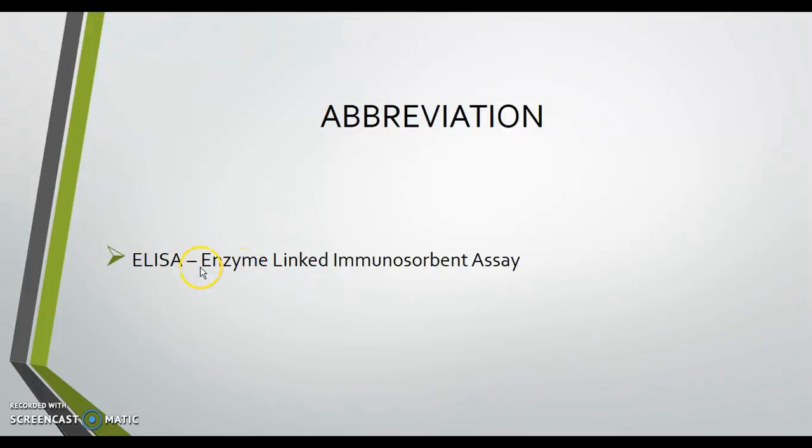The abbreviation is the name of the procedure that I'm explaining. It is called enzyme linked immunosorbent assay because the secondary antibody is linked with an enzyme, and it is used in the ELISA procedure.